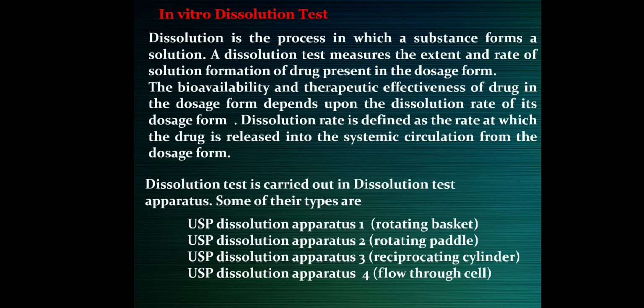In vitro dissolution test. Dissolution is the process in which a substance forms a solution. A dissolution test measures the extent and rate of solution formation of the drug present in the dosage form. So in dissolution, simply speaking, we find out the capacity of a tablet to go into a solution. The bioavailability and therapeutic effectiveness of a drug in the dosage form depends upon the dissolution rate of its dosage form.